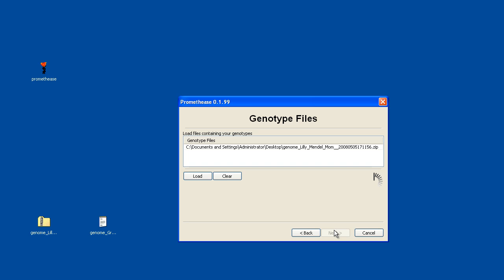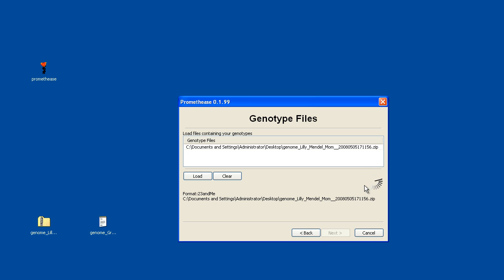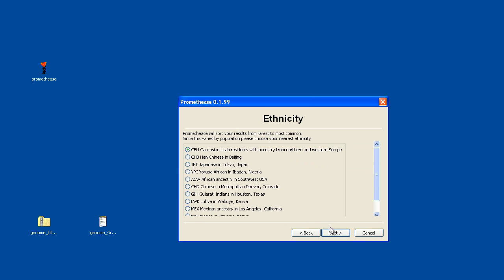I'm going to pick the genome from Lily Mendel. Click on Next. At this point the little spinner begins. It shows me it's a 23andMe formatted file. What file name is there? It's going to count off how many genotypes are in there. We can see that number there, about 570,000.